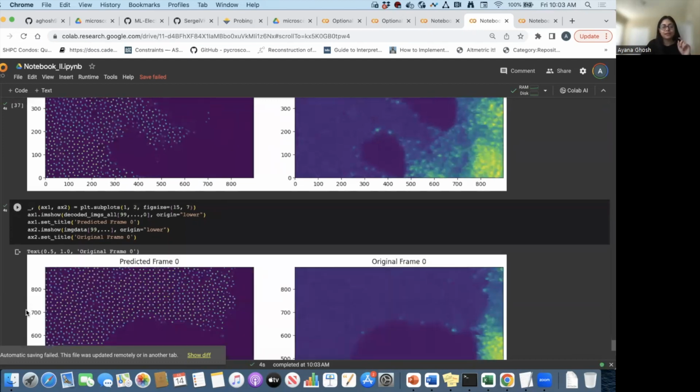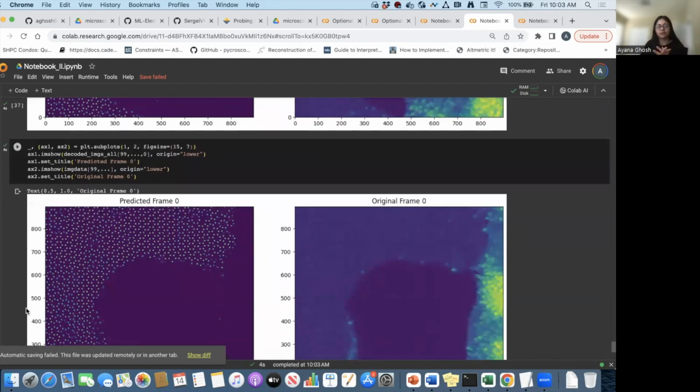So for this data, we also had defects. Like the silicon atoms were there. And that's the next part of the tutorial, which I'm not going to go through because it's essentially doing a similar thing. It's just a multi-class segmentation mask that we're going to make, but that is available to you through the tutorial from my page.